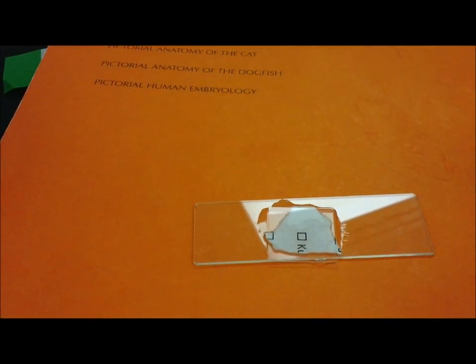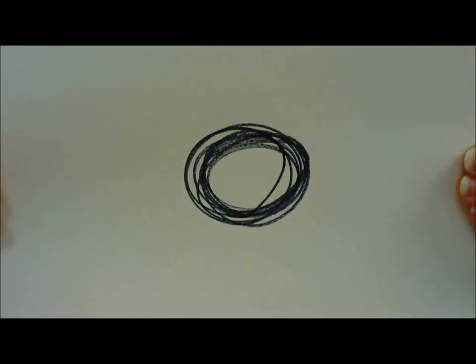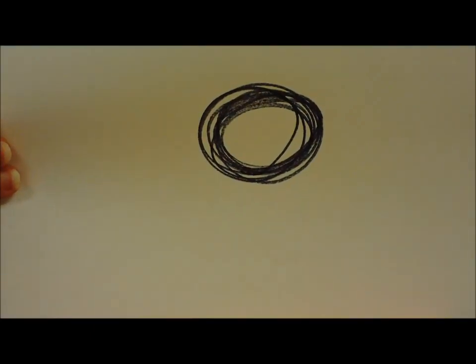If you look at your slide and this is what you see, you are seeing an air bubble and you'd want to take the cover slip off and try again.